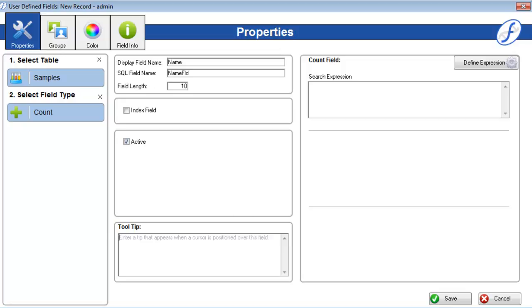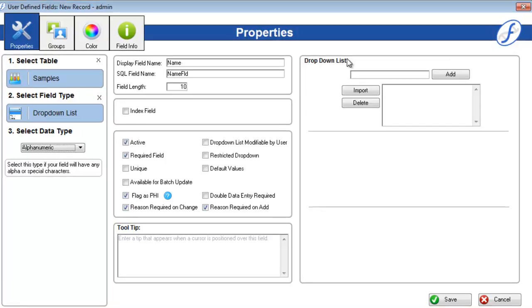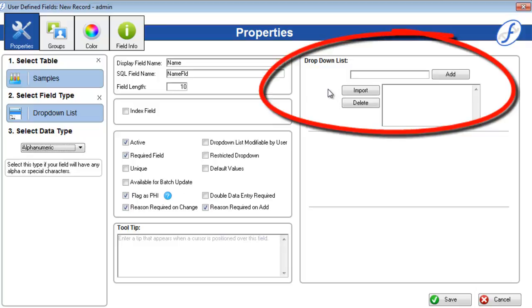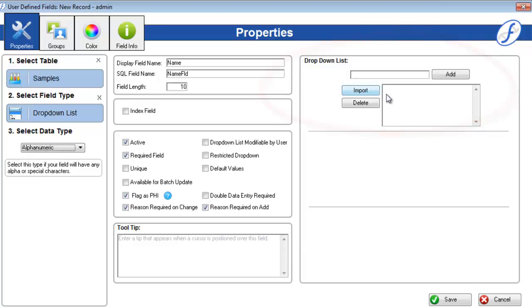Some field types require more configuration than the initial properties page. You'll notice that these fields have the top of the three boxes on the right filled. A drop-down list field requires that you enter some values for users to eventually select from.